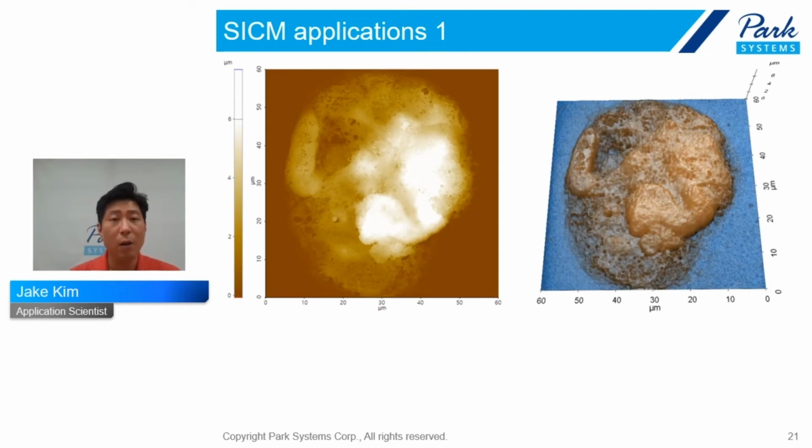The main role of detergent on the cell membrane is disruption of the cell membrane and the formation of very tiny holes in the cell membrane surface. Through these tiny holes, the internal cell membrane proteins can be extracted while external antibodies can be introduced. And SICM successfully investigates these tiny holes on the cell membrane.